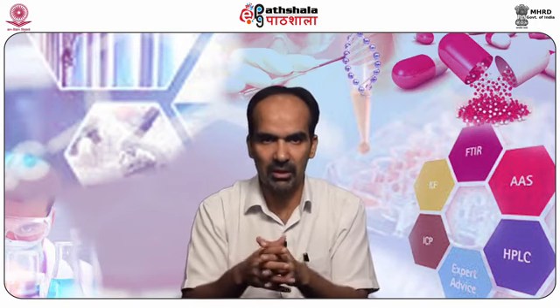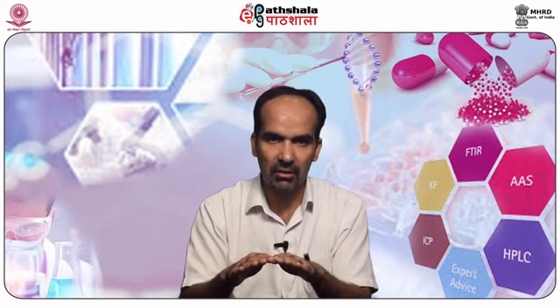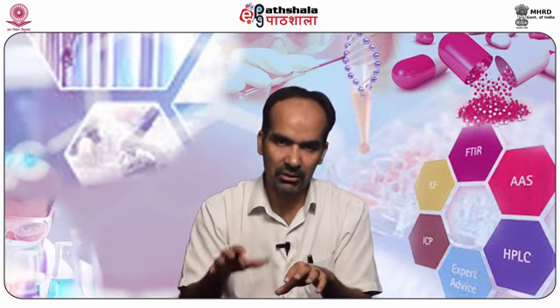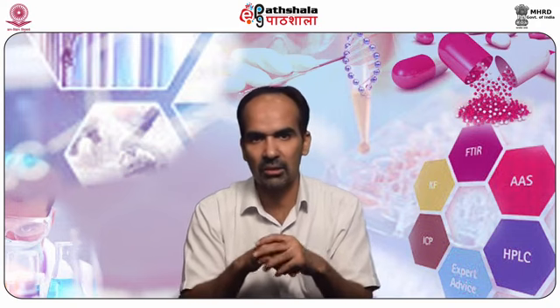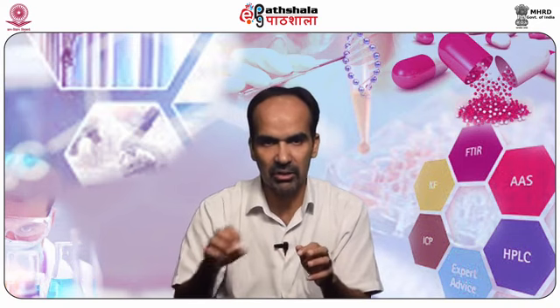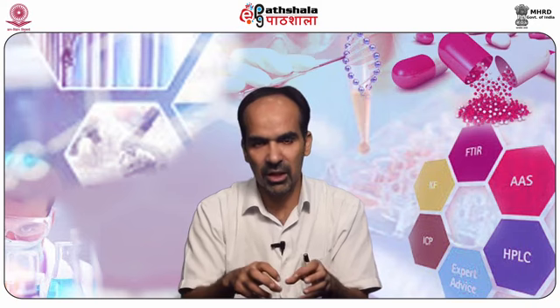So here, on a plate of glass or a metal plate, molten fat is spread and allowed to stand. Then the sample which contains volatile oil, like flower leaves, like rose leaves, is put on that cooled fat layer. It takes away the volatile constituents. After its exhaustion, after 3 hours or even days, new leaves are collected and put on this fat layer. Then the volatile oil is obtained by solvent extraction.